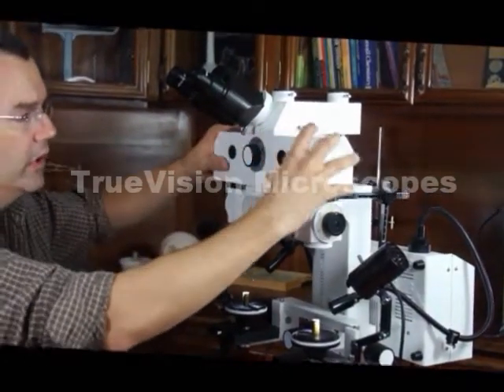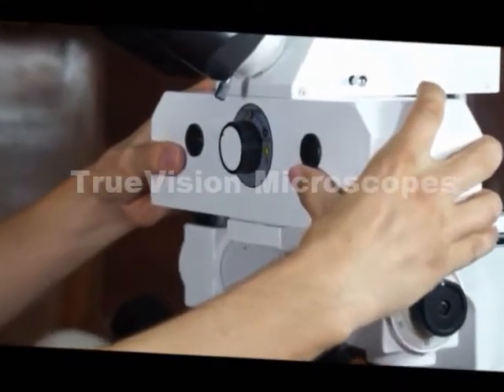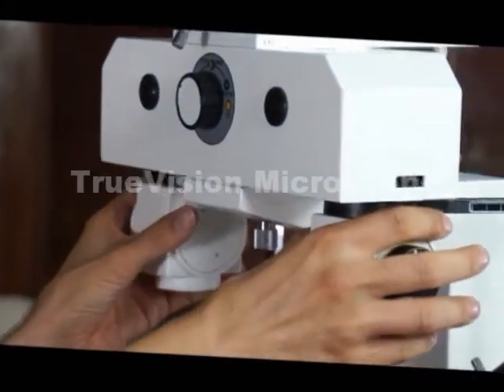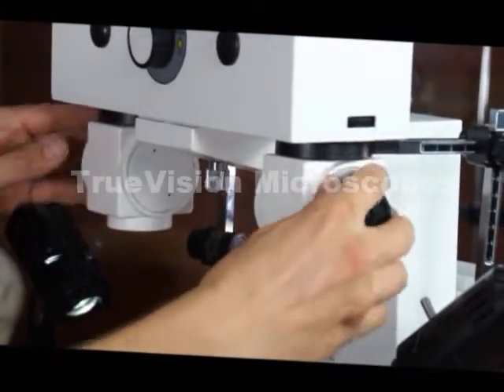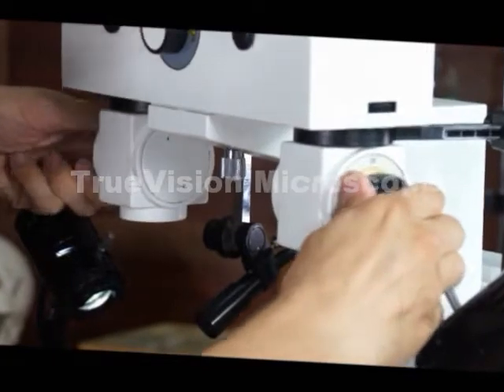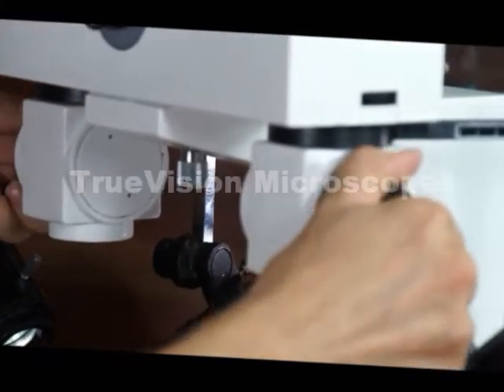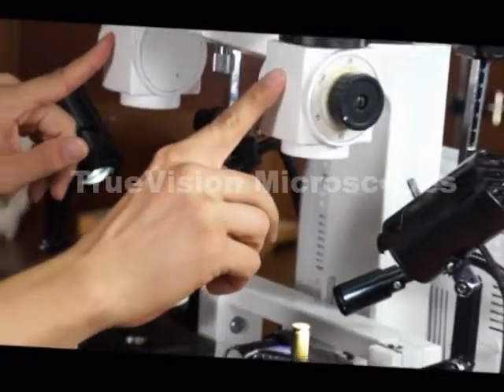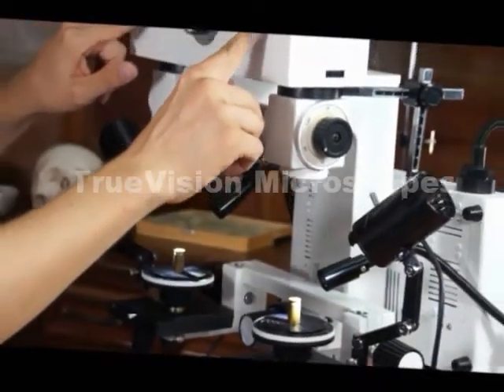This is considered the bridge. The objectives are located at this point and are adjustable. The light paths enter through the objectives into the bridge.